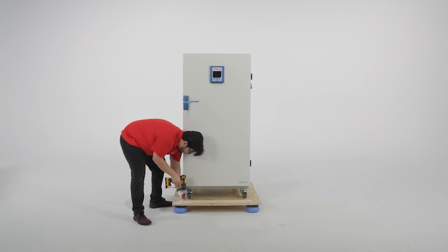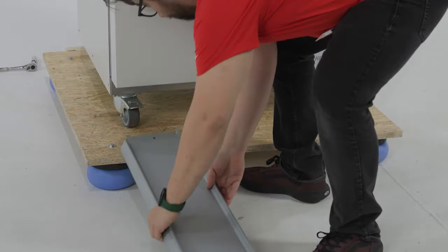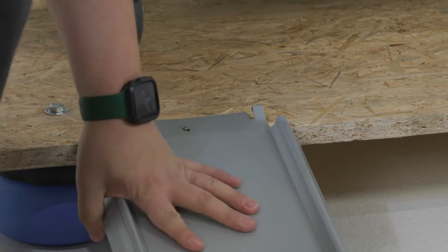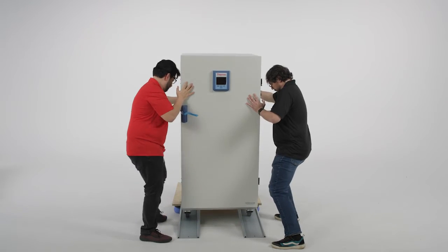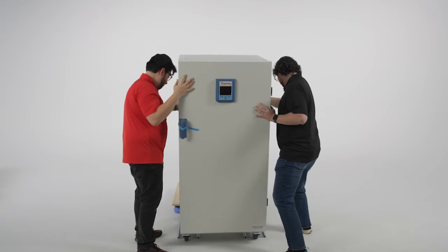Using the screwdriver, remove the wooden support frame from either the front or back of the unit. Line the rails with the casters and screw the rails to the pallet for safety. With two people, gently roll the unit forward down the rails until the unit reaches the floor.